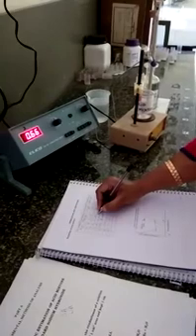Now the next 0.5 ml is going into the beaker. You can see the decrease in the conductance value as the hydrogen ions are reacting, 0.64. The next 0.5 ml. As long as there is hydrochloric acid, that is hydrogen ion, there is a decrease in the conductance value. When all the hydrochloric acid is completely reacted, let's see what happens. The next 0.5 ml is going into the beaker. You can see 0.61 in the previous reading; now it's increased to 0.66. That means you got the first end point here, which is considered as V1.